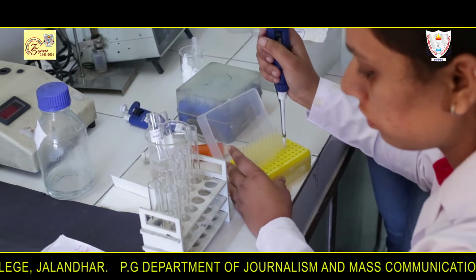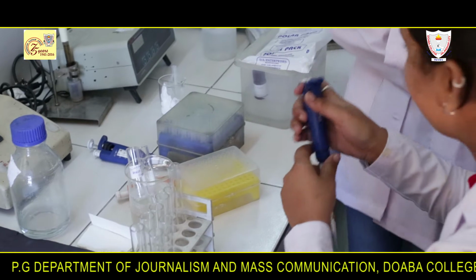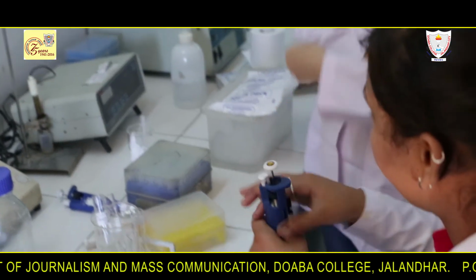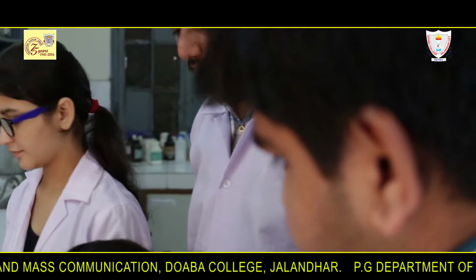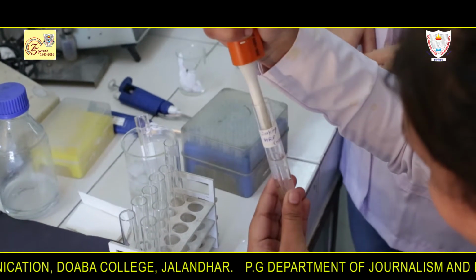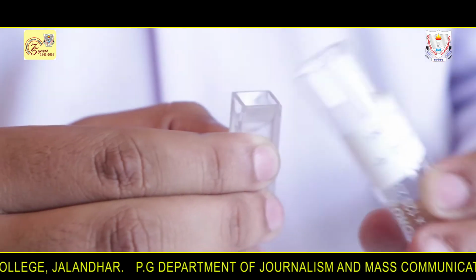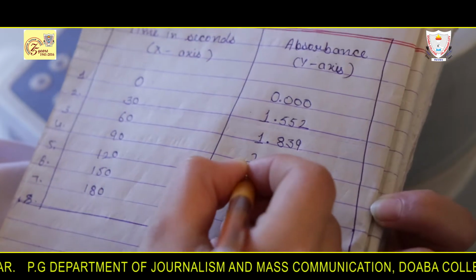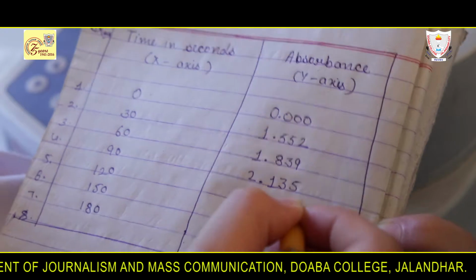Add the reagents in tubes as mentioned earlier, except decreasing the amount of enzyme concentration. Adjust the reading to 0 absorbance with tube 1 blank and start the reaction by adding 400 microliter of HRP solution to tube 2 and read the absorbance of the mixture at 470 nanometers at every 30-second interval for 3 minutes.